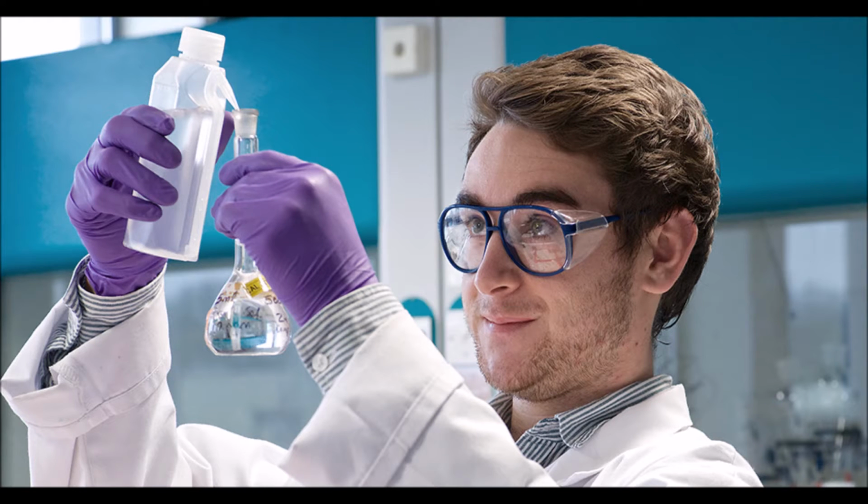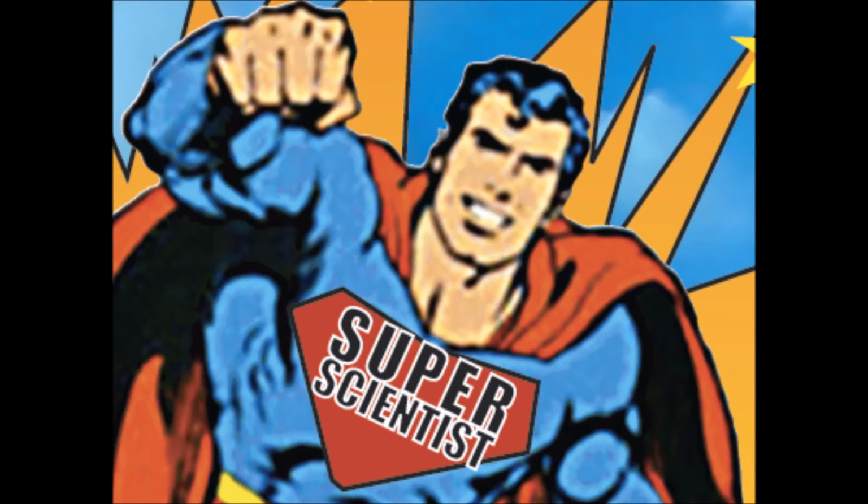Now, that might be enough information on how to make crystals for most of the kids back home, but I know there are a few of you clever little chemists who want to know a little bit more about how to make crystals. So for all of you, I'm going to tell you about a little process I like to call vapor diffusion. Everyone else actually likes to call it vapor diffusion as well. That's just the name of the process.